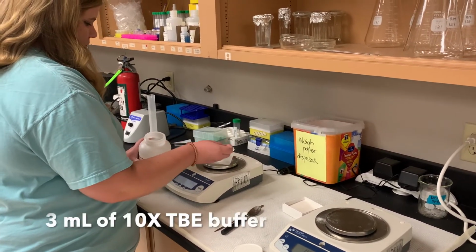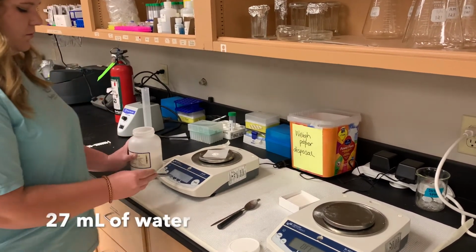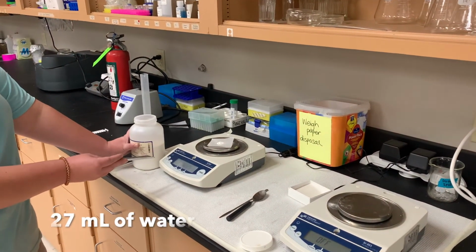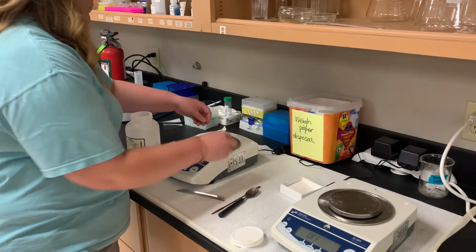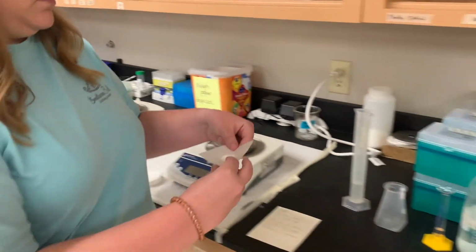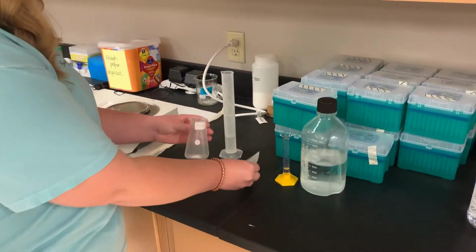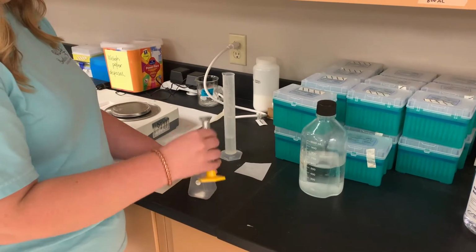To do this, combine 3 milliliters of 10x TBE buffer to 27 milliliters of water, thus diluting it to 1x TBE. To this, add 0.225 grams of agarose powder. These ratios may be changed to reach the desired consistency of your gel.